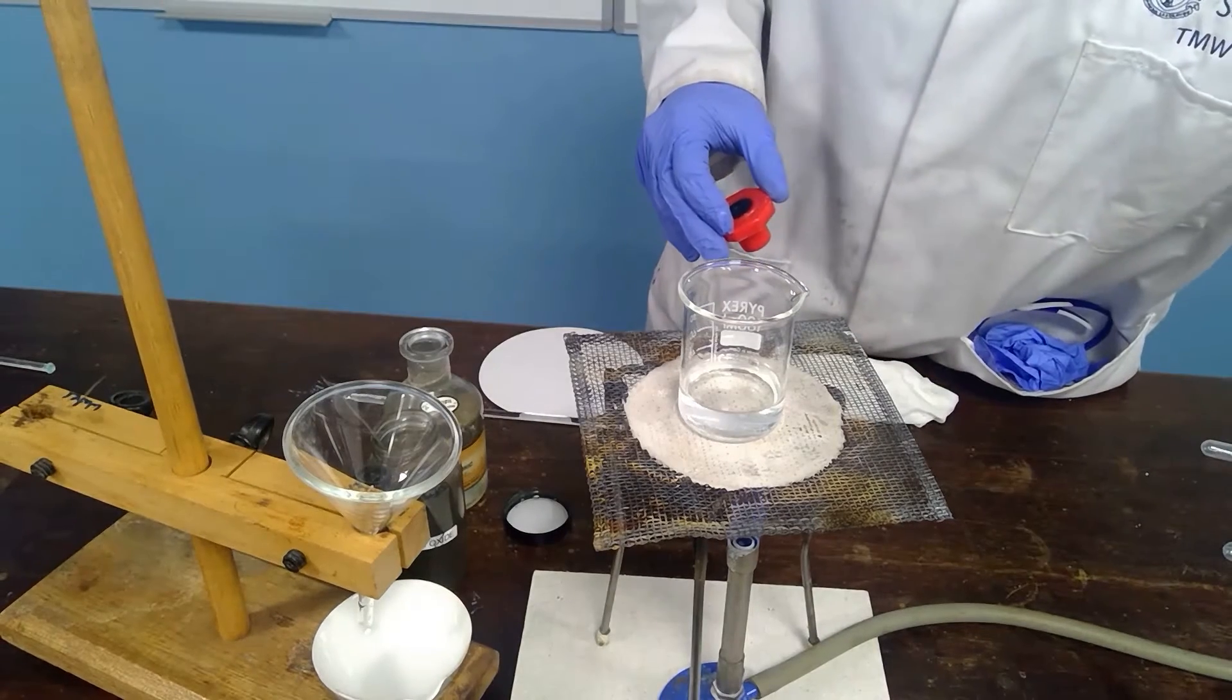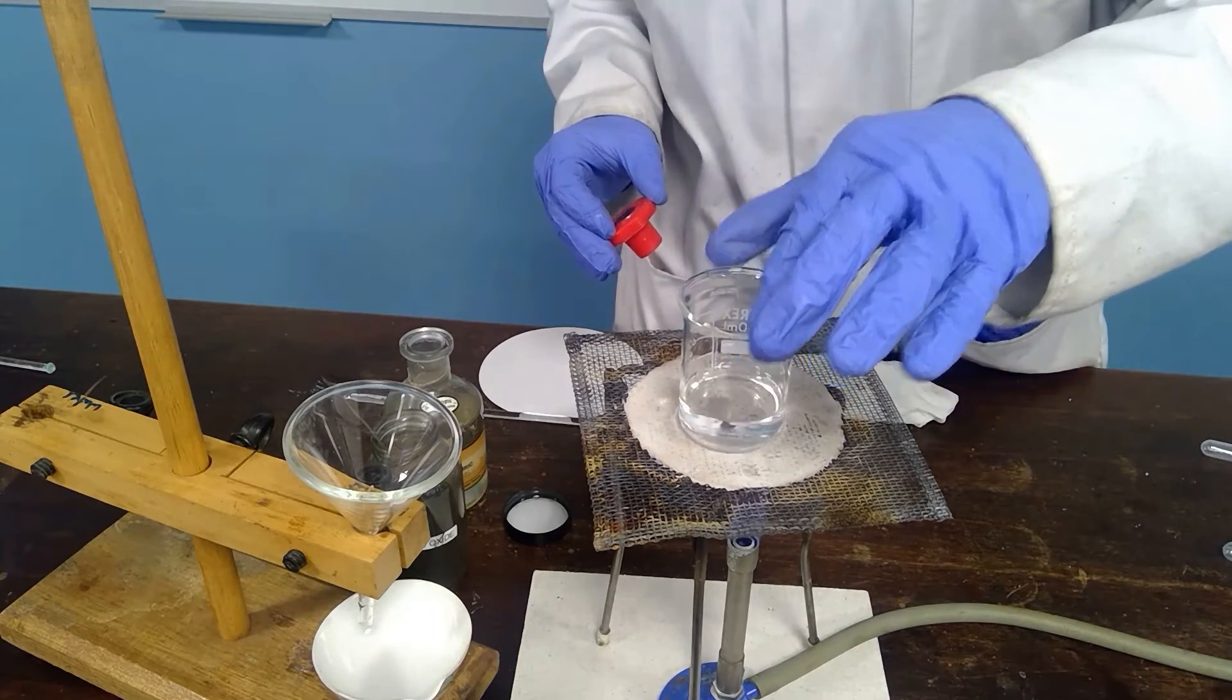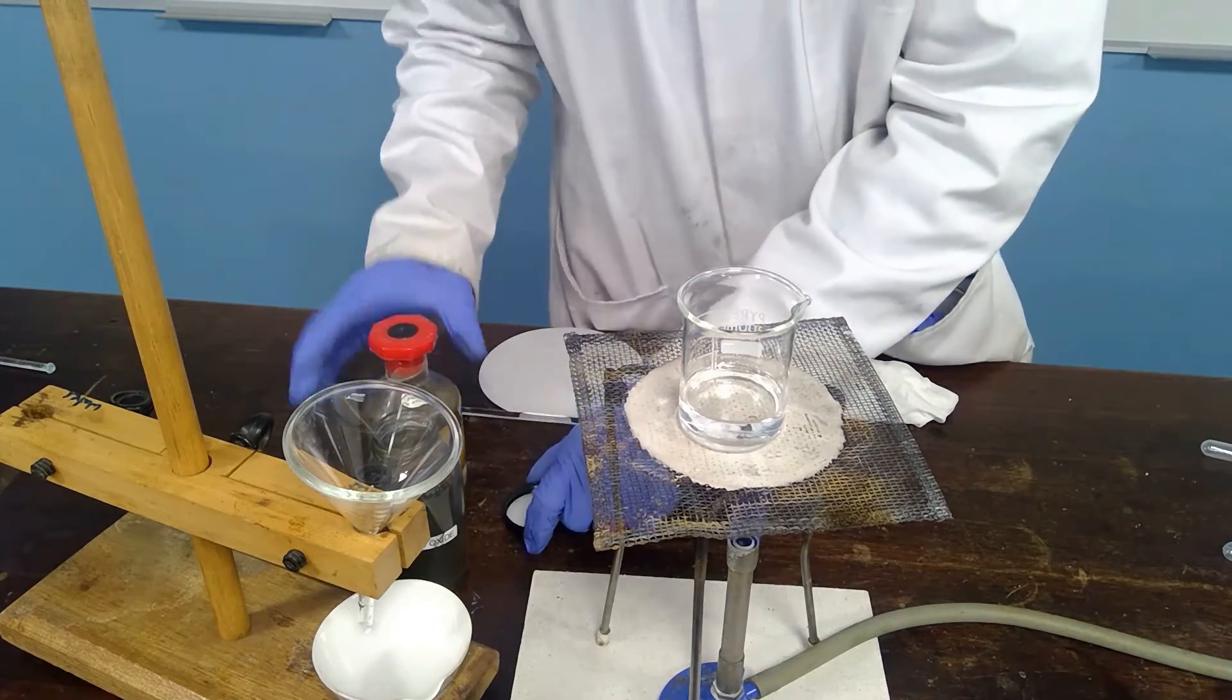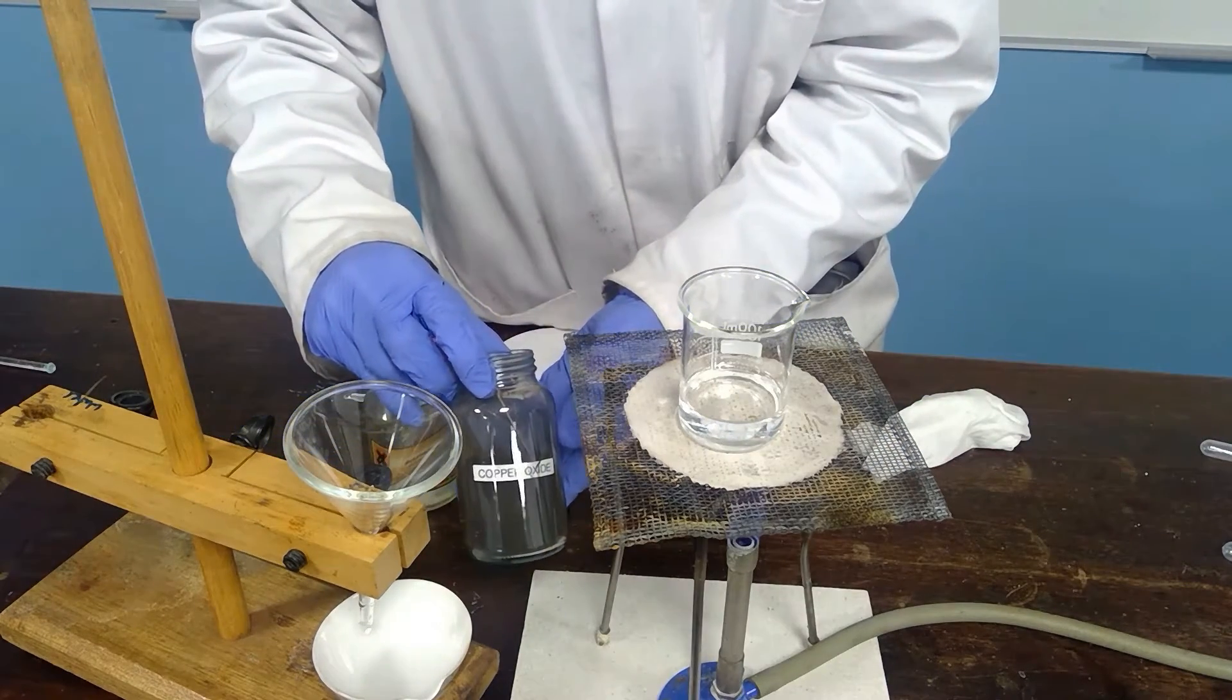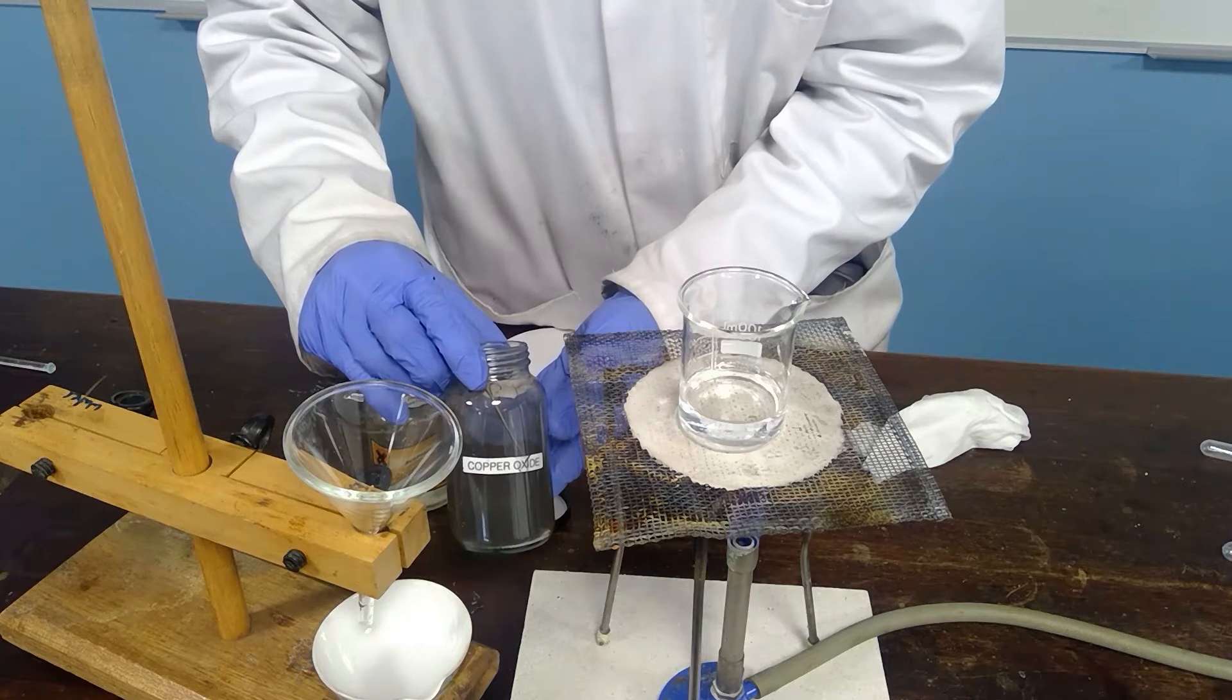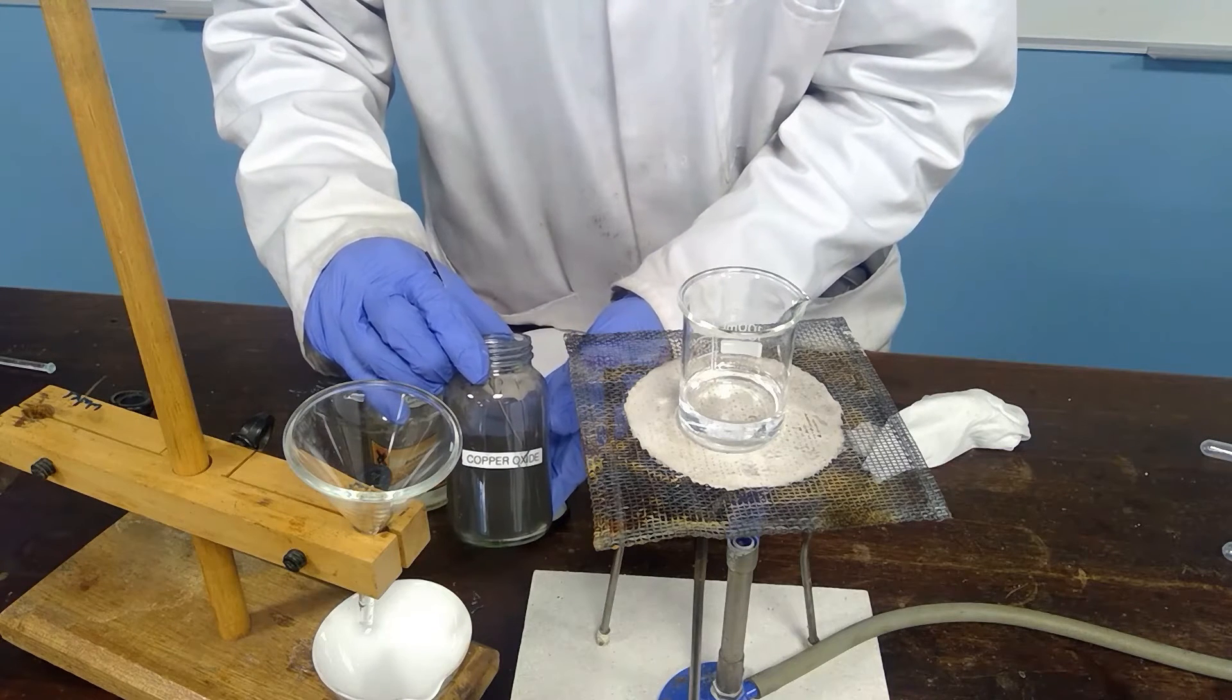We will warm the sulfuric acid first of all so we have got hot acid in the 100 cm cubed beaker. We're going to add to this copper oxide which is a black solid. It is insoluble in water but it does react with the sulfuric acid to form copper sulfate and water.